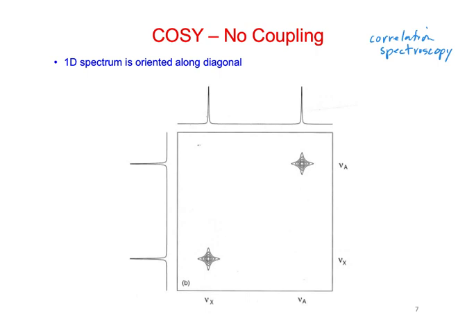All right, so this is a spectrum here. We have 2 dimensions. Again, we have F1 and F2, which come from time domains T1 and T2. In this spectrum, we have 2 different frequencies, and so we see 2 in both dimensions.